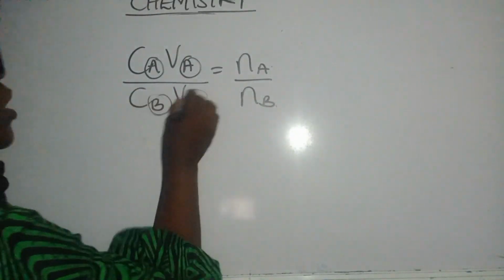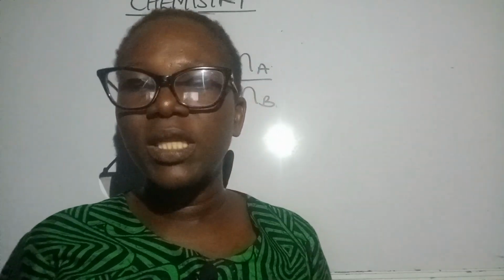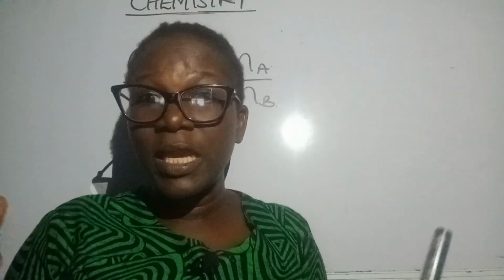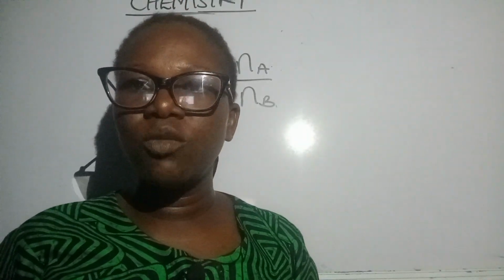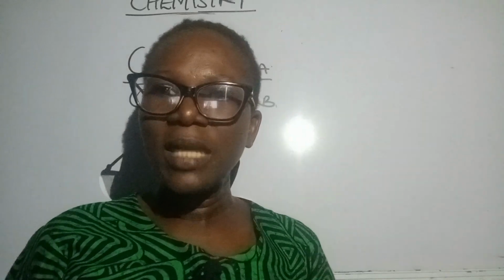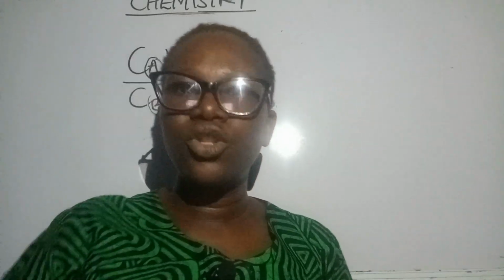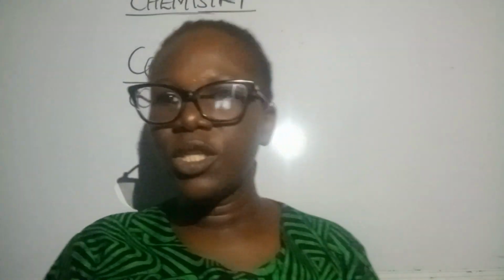Now, we are not working with acid and base if you are working with a redox titration, for instance. It's just a matter of titrating a reducing agent with an oxidizing agent. The oxidizing agent, for instance KMnO4, will be inside the burette, which has a purple color, and the iron(II) will be pipetted, a green solution. The iron(II) can be acidified. After pipetting the iron(II), you can add a certain volume of dilute H2SO4, sulphuric acid, to it before you titrate with the KMnO4 inside the burette.